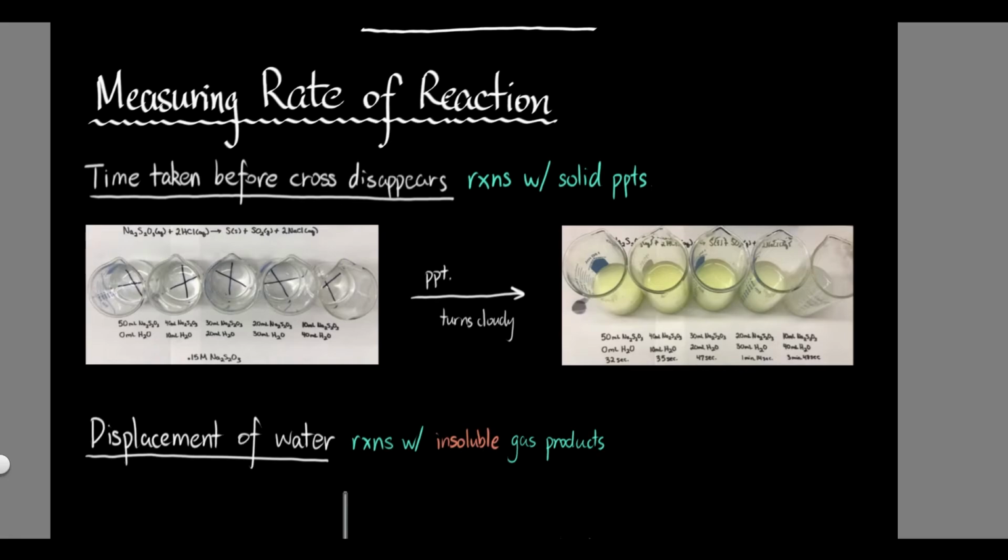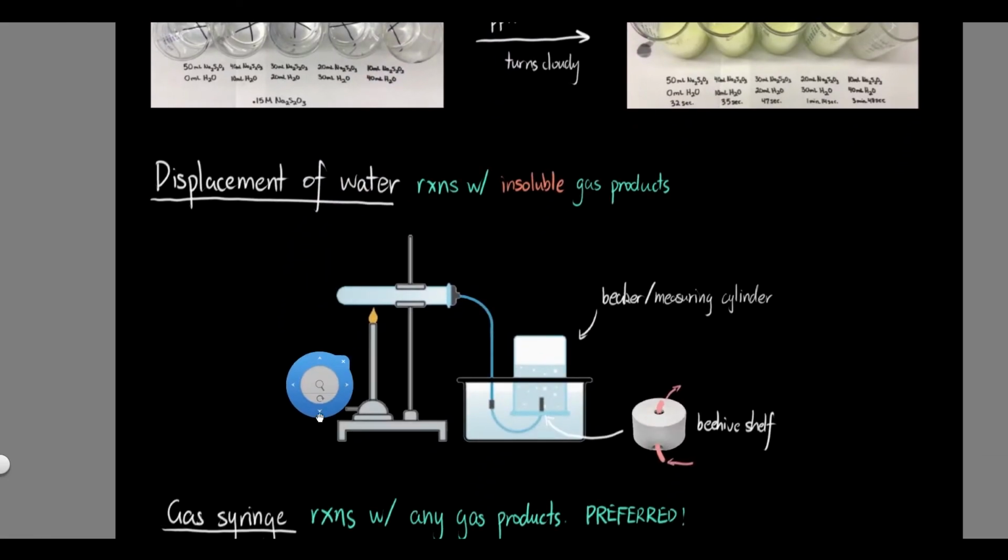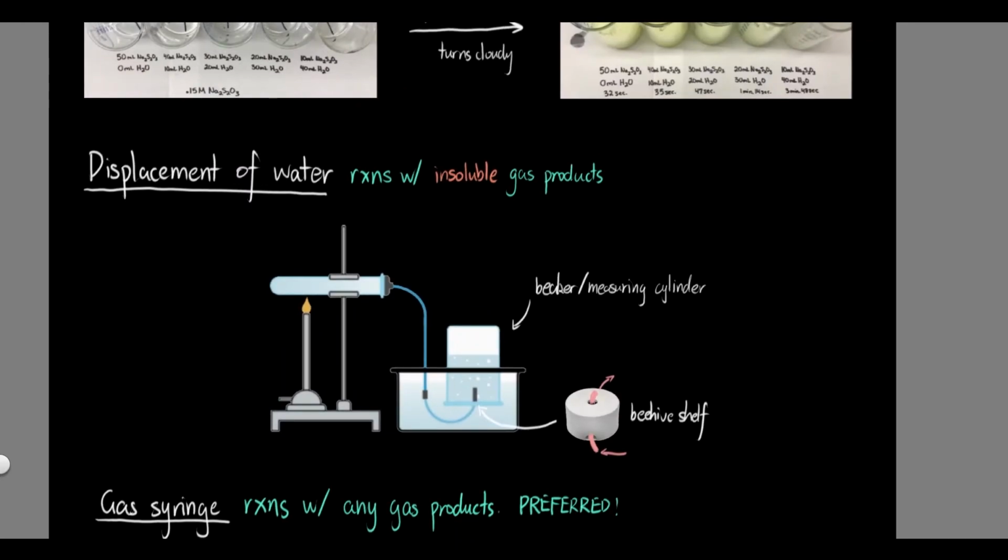So the next one is displacement of water. This would work with any reaction with insoluble gas products, because you're going to bubble it through water, and if it's soluble, like carbon dioxide, you're probably going to get aqueous carbon dioxide, which is no use.